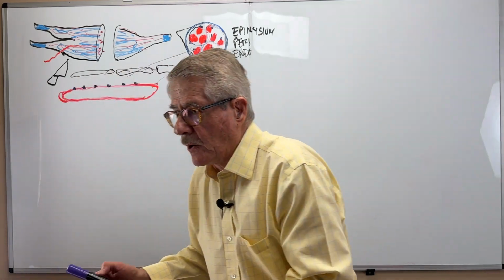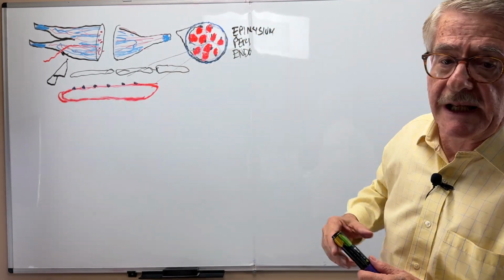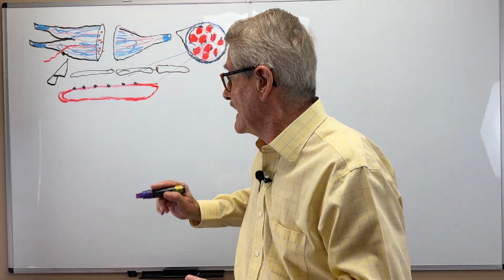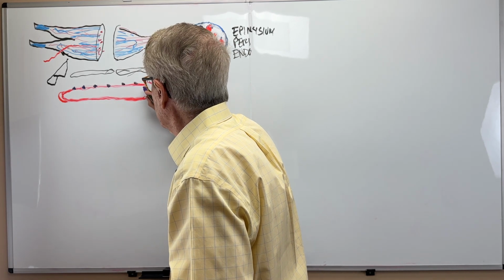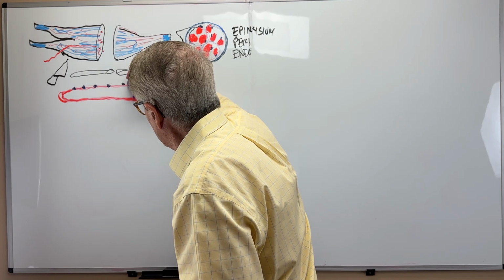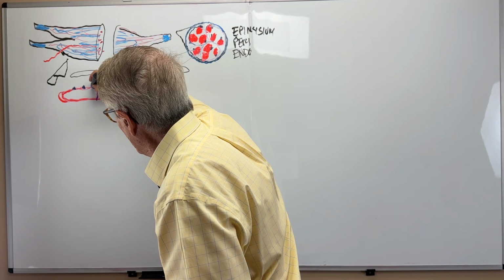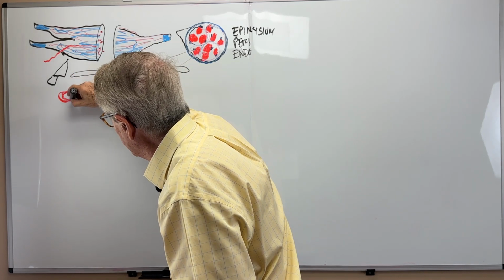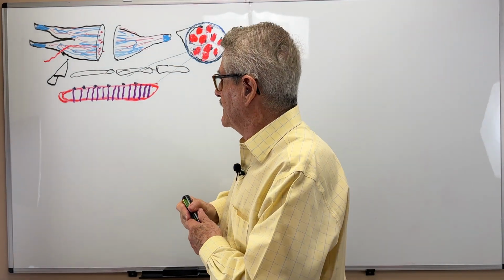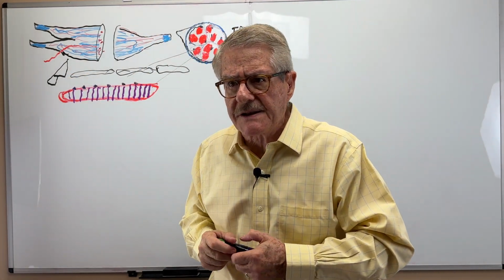Yes. When you look at it on a microscope, the cell is not totally homogeneously red, but it has striations. In other words, it is a striated muscle, which is the most important striated muscle, if you want. The muscle has these cross striations, one of them dark and the other one light. This is an oversimplification, but it definitely shows that the skeletal muscle has these striations.